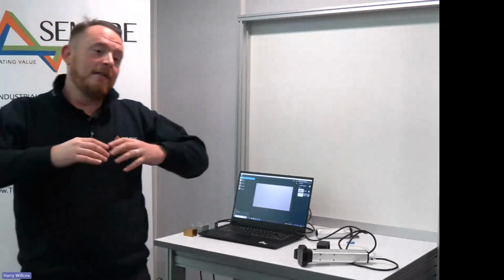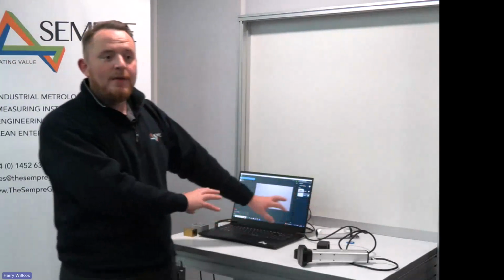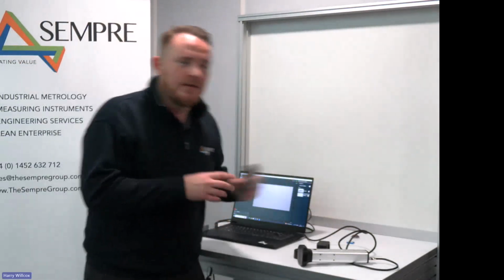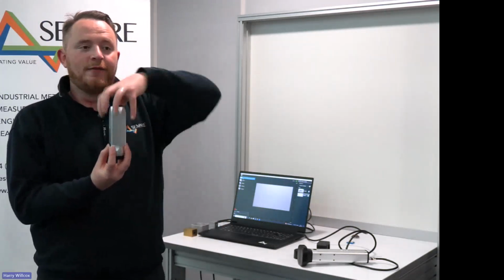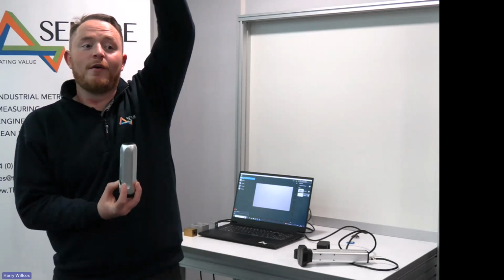To answer that, unfortunately at the minute, Gelsight only provide the two systems we have here with the field of view. The difficulty is that if you were to take the Gelsight Series 2 and say I want a pad that's 3 or 4 times the size, unfortunately, for the way that optics work, the camera starts to get further and further away.